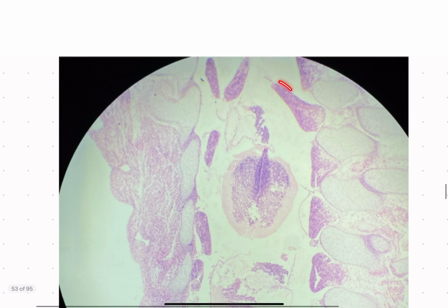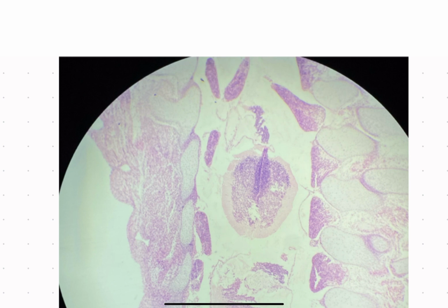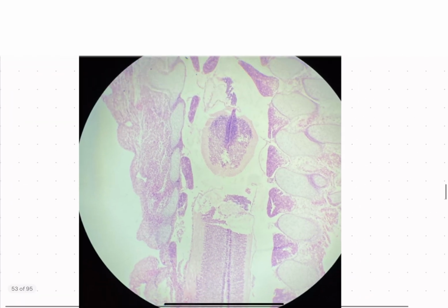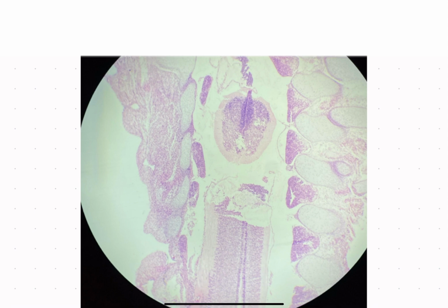And one of those basic structures is the spinal ganglion. So all of those dark areas you see are the spinal ganglion. We also have the pia mater, which is just floating around a little bit frilly like so. You can see it here as well. And then we have a very interesting dichotomy, I guess, of this spinal cord. We have this cross section as well as the longitudinal section.